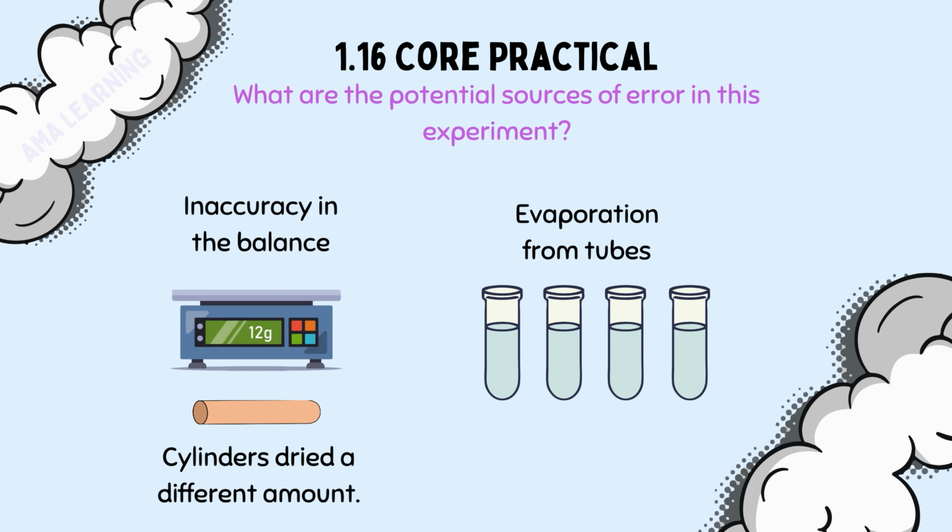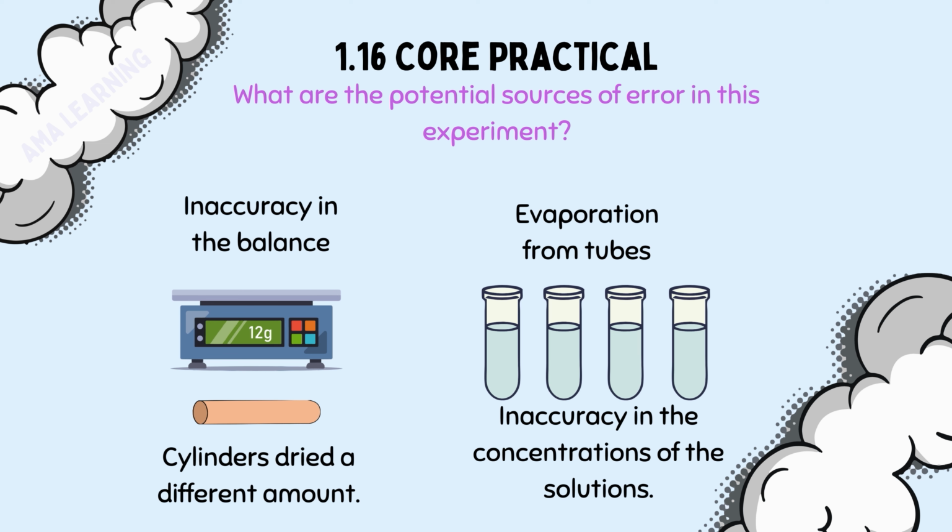Evaporation from tubes. It is advisable to cover the test tubes with some plastic wrap or a bung. Inaccuracy in the concentrations of the solutions. Clearly labeling the test tubes helps to avoid this error.